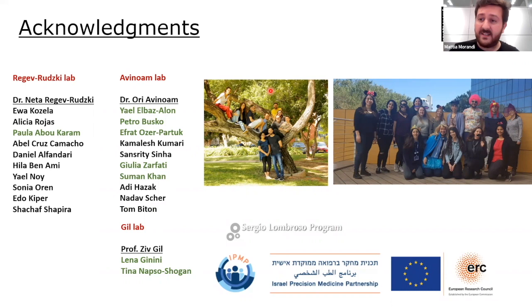What one could do that is easier is correlative microscopy. You could stain the EV in one color and the liposome in another color and look at them in fluorescence, and then go in cryo-EM to look only at points where the two are. From my experience, we can actually tell them apart, especially in tomography. When you start seeing the protein corona, you can tell what is a liposome and what is an EV. And in 2D, the luminal cargo spatial distribution, for us at least, was a very good indicator. It was really consistent. But obviously, there are more sophisticated methods where you can tell 100% what is what. Sure, thank you.